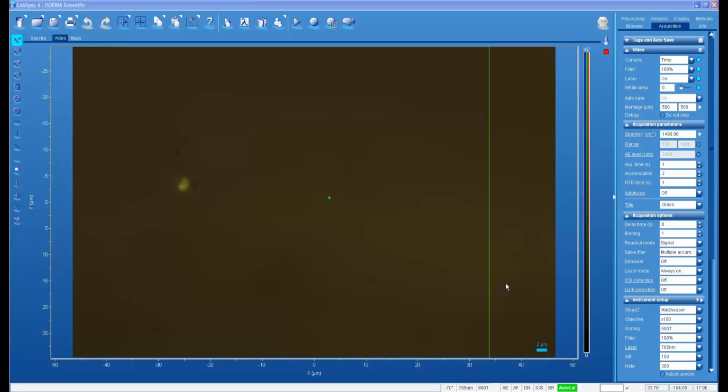Alright, so now I have replaced the glass microscope slide with a piece of fused quartz, which comes in small 1-inch squares or circular pieces, or even the conventional dimensions of a microscope slide, and they come from GM Associates. They're an excellent company, and they provide these fused quartz substrates as, I think, a very good substitute for microscope slides, and I'll show you why I believe that to be the case in just a moment.